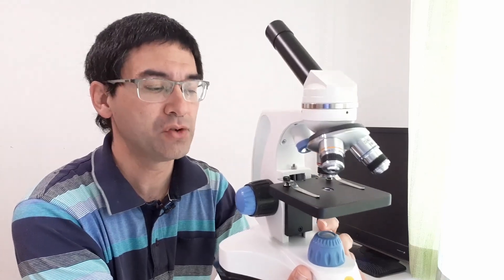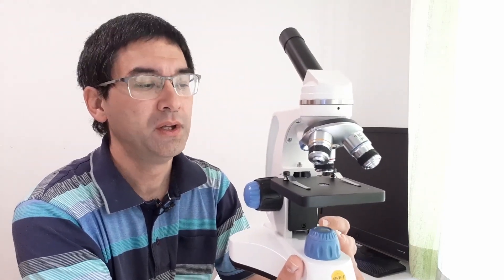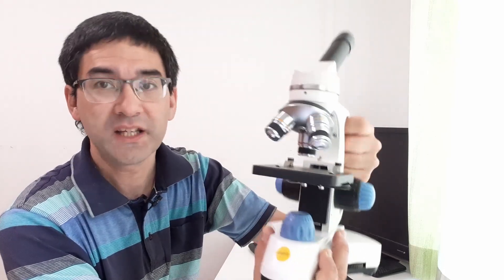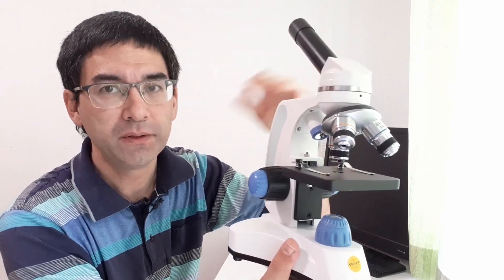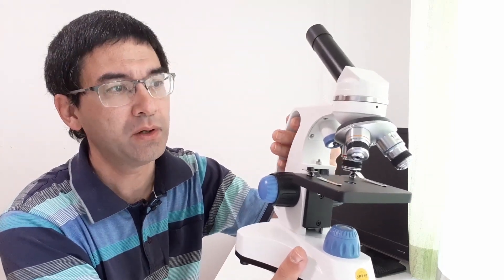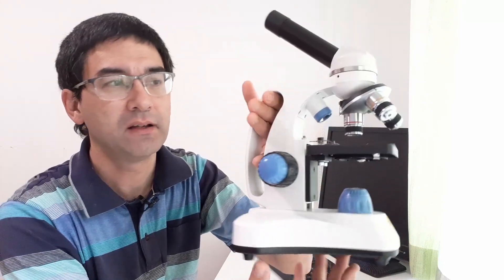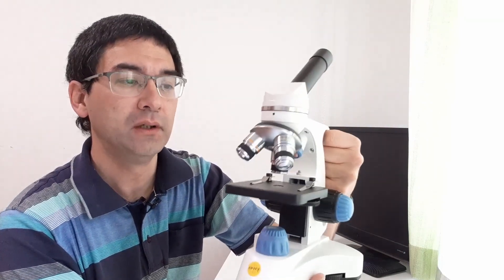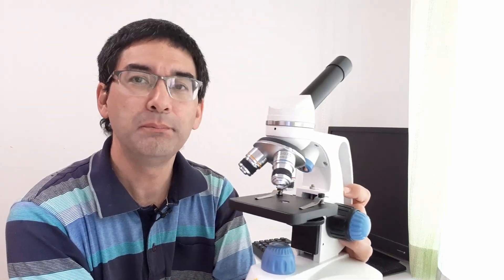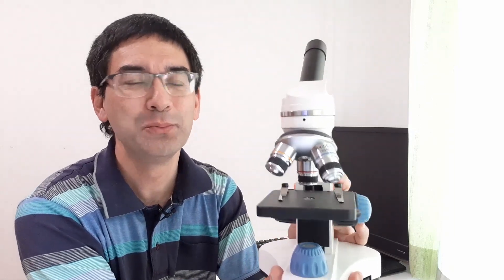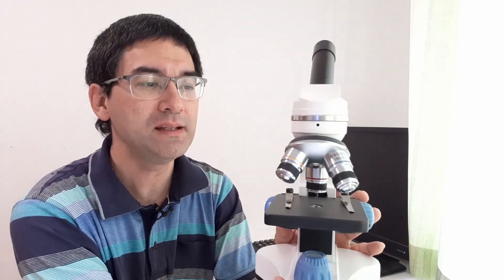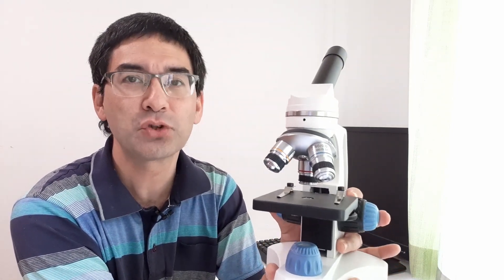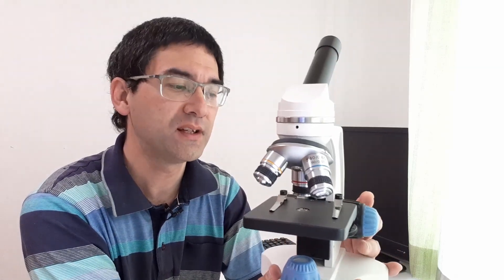There are only a few plastic parts here and I think this actually qualifies it to be considered a serious microscope, especially for those people who need one for transport. Maybe as a travel microscope or for children in lower schools where they cannot carry heavy microscopes around. There's a handle here.